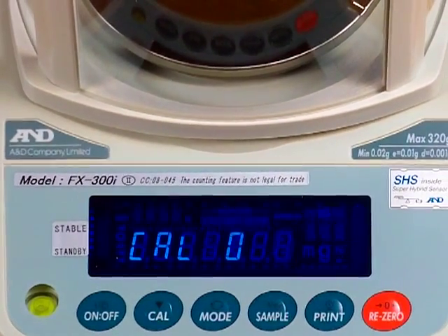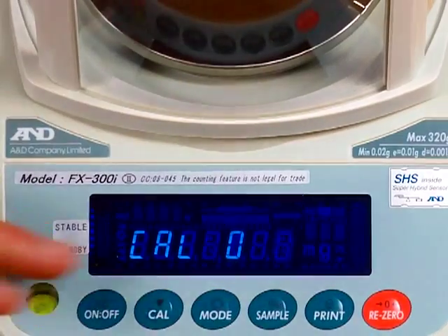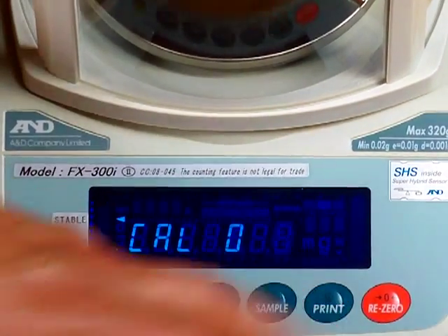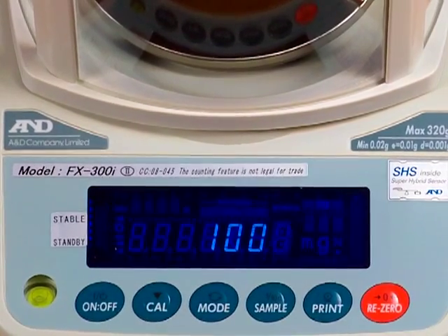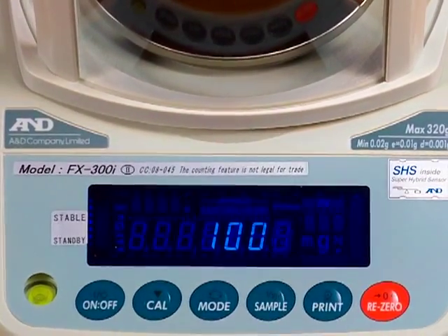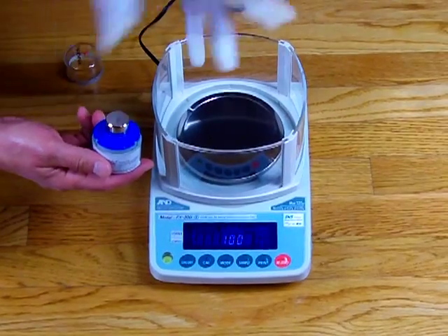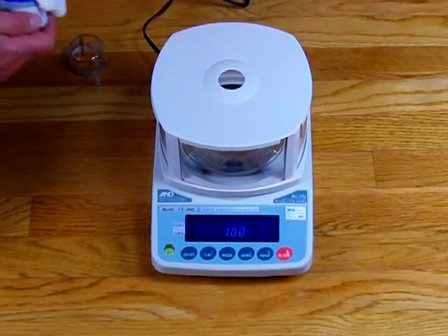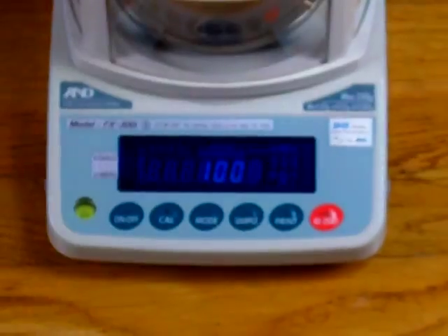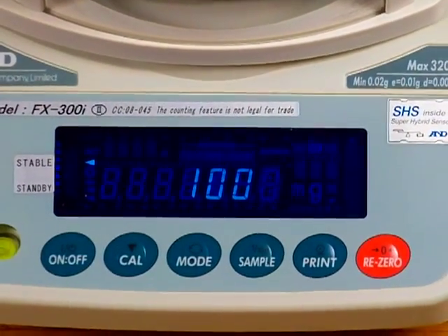We've stored the 100 gram value and we're back at CAL zero. To start the calibration, press the PRINT key from CAL zero. You'll see a little arrow in the top corner as it stores the zero reference voltage, then it flashes '100.' Now we need to place a 100 gram calibration mass — this is a Tromner class 1 calibration weight, which we sell. Put the glove on, place the calibration weight in the center of the balance. It shows 100 on the display. Press the PRINT button to store that value. We're getting a stable reading and it's storing the 100 gram weight.